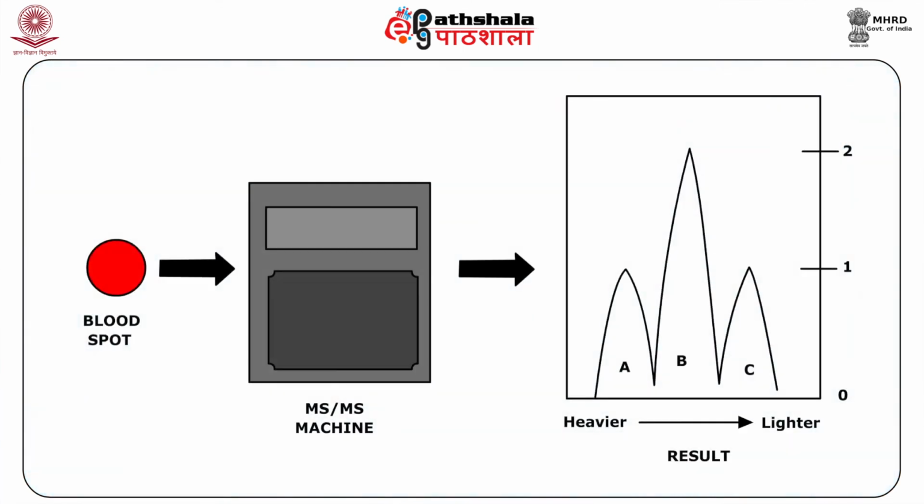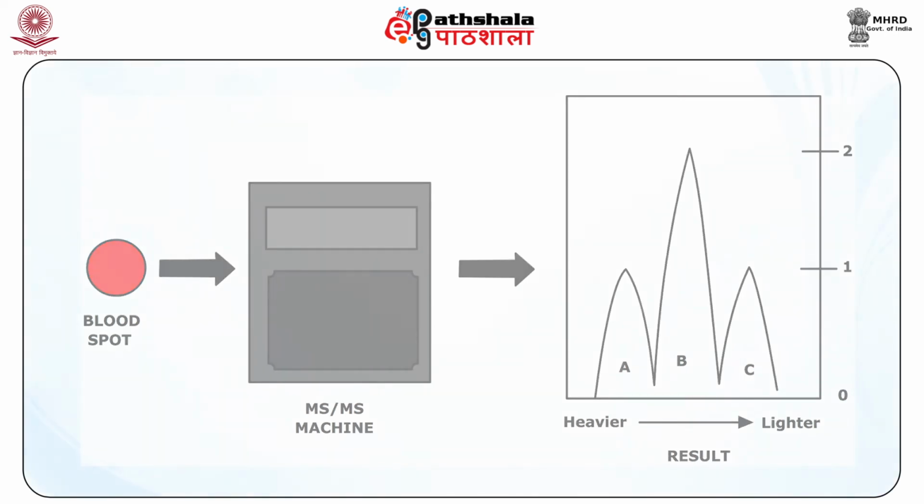Note the figure in which the blood from a newborn can be screened for sickle cell hemoglobin or any other molecular variant of the normal hemoglobin within minutes just using a drop of blood. This could be important information for the neonatologist in the course of treatment to be followed.